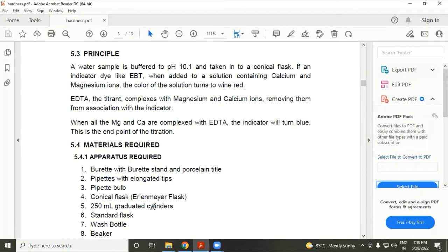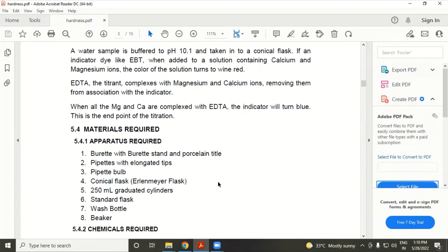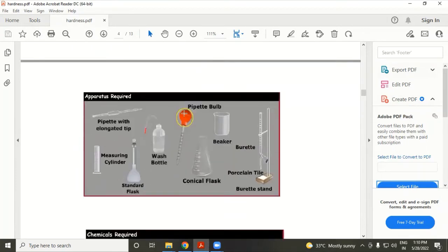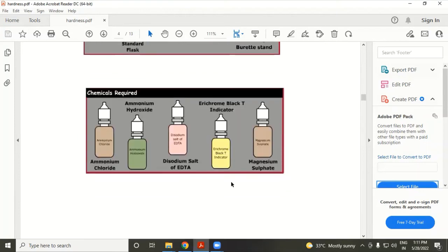The equipment used includes a burette, pipette, pipette bulb, conical flask, measuring cylinder, wash bottle, and beakers. The chemicals used are ammonium chloride, ammonium hydroxide, EDTA (ethylene diamine tetra-acetate acid), Eriochrome Black T indicator, and magnesium sulfate.